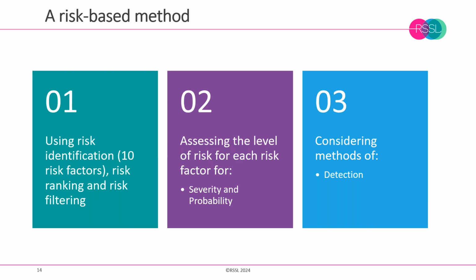But because we're looking at a group of clean rooms and we want to set appropriate frequencies, we need a system for ranking those risks. So we need to be able to say that a given room is of a greater risk and therefore might require higher environmental monitoring frequency than another room. And if we're going to group rooms together to try and develop a coherent environmental monitoring program, then we need a process of filtering those risks.